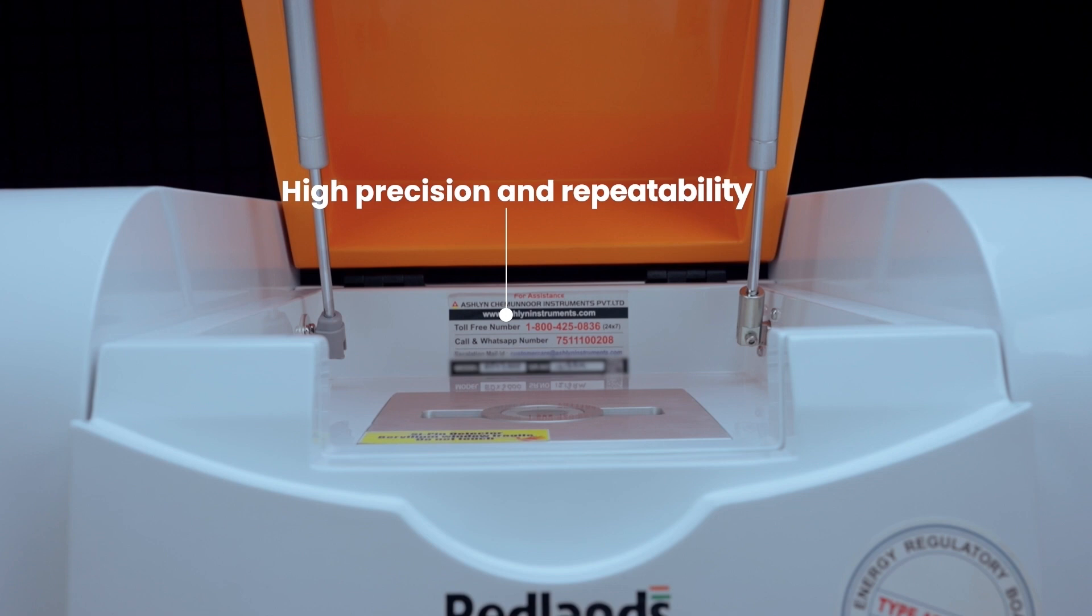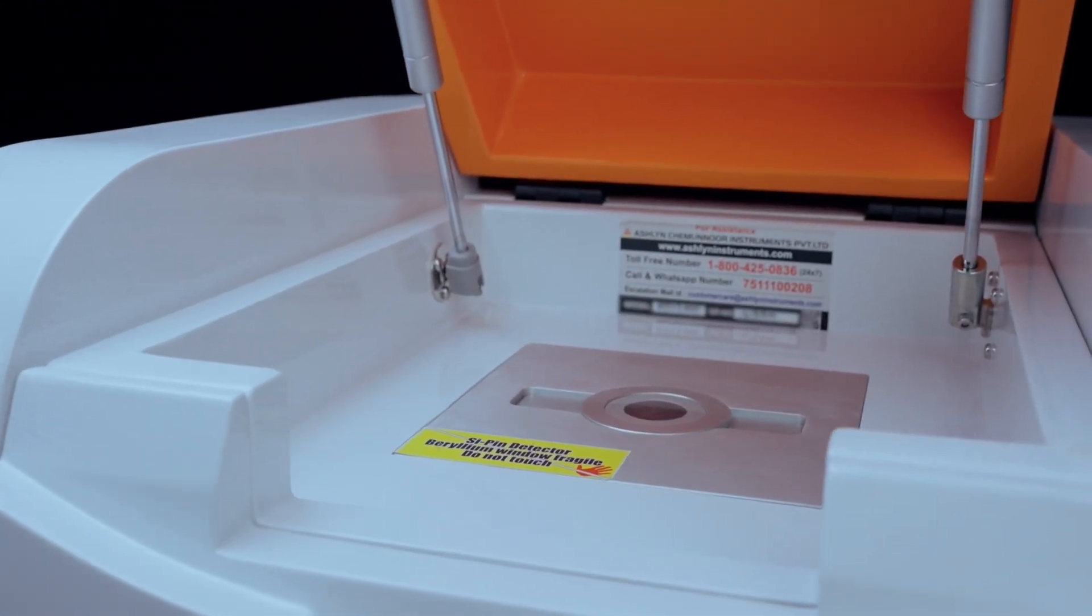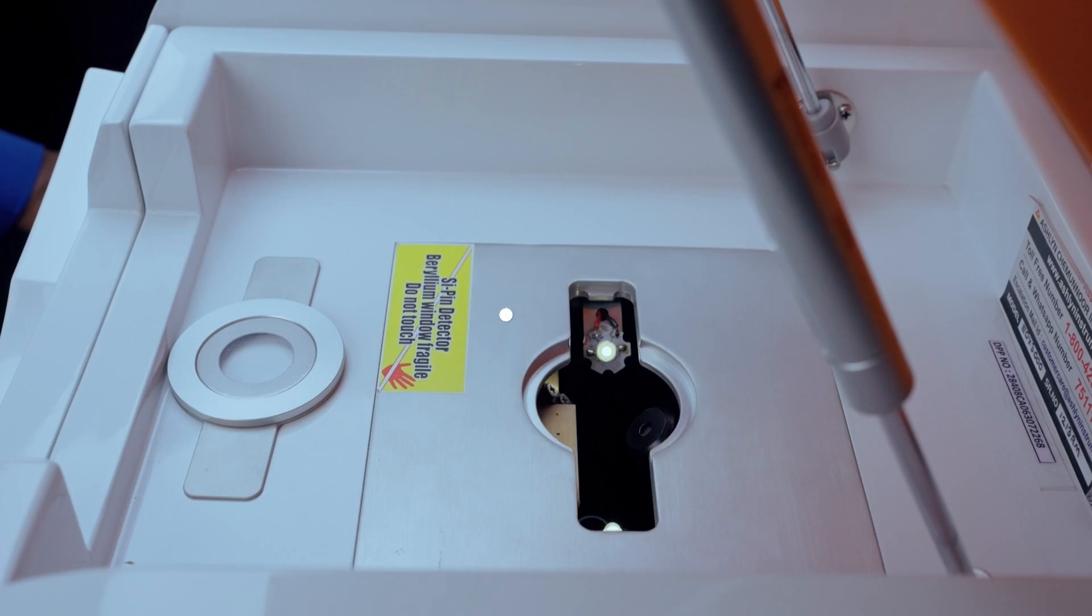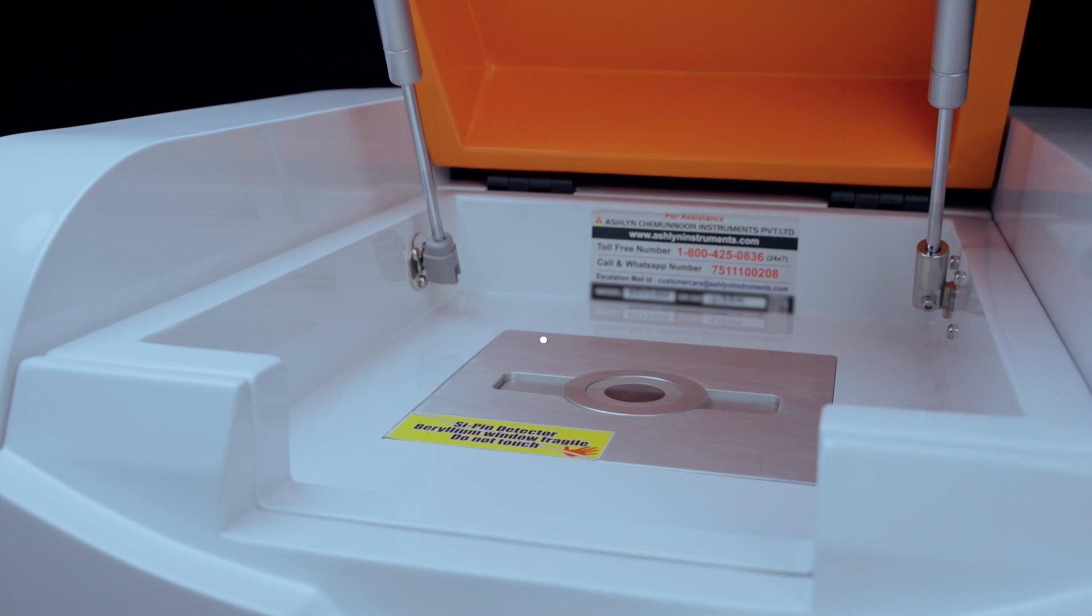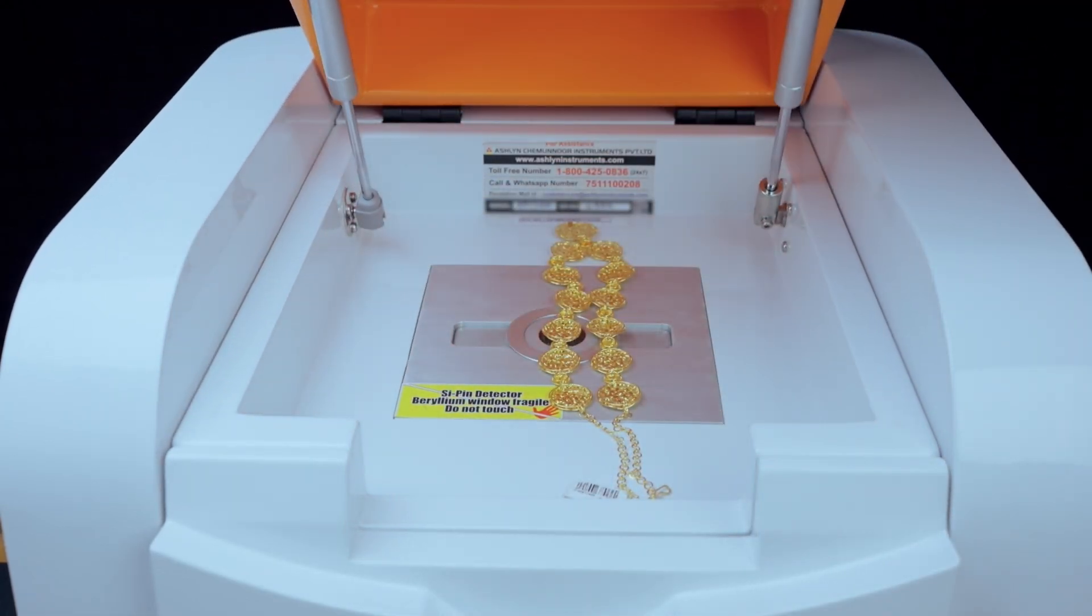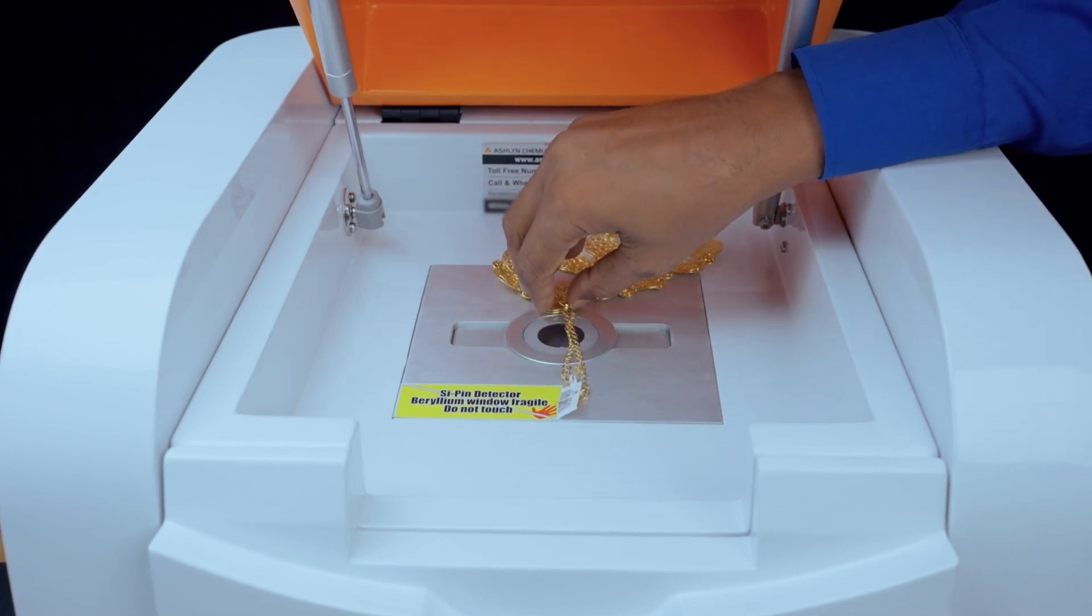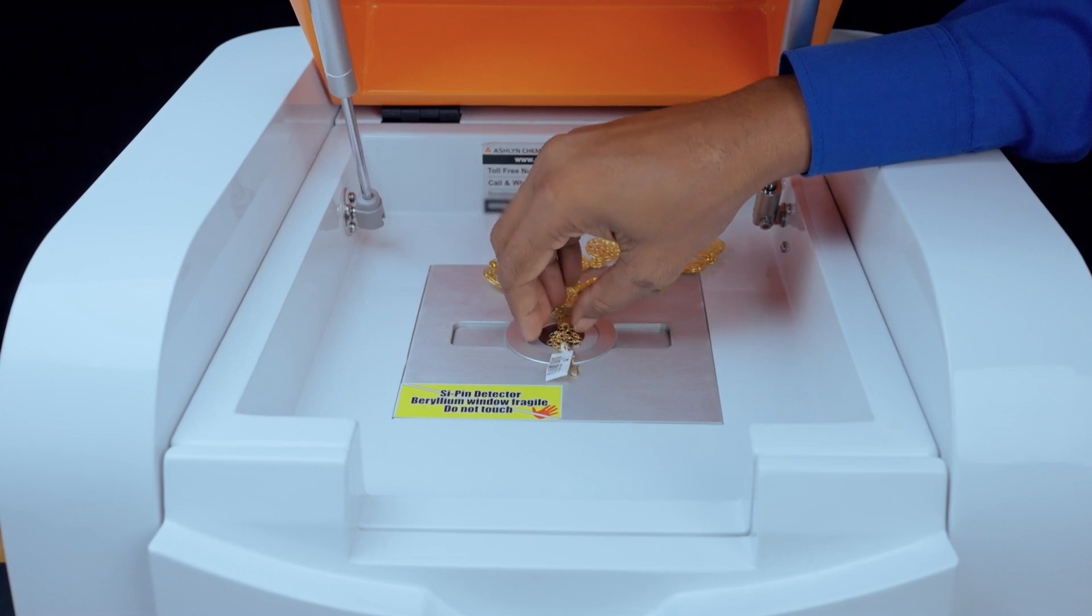The unique feature of wide and spot scanning enabled by the multi-collimator facility makes the Redlands EDX3000 operation highly accurate and precise for valuation. Wide area scanning ensures accurate results by averaging soldered and non-soldered portions of ornaments, while the point collimator allows precise spot valuation even after scratching.